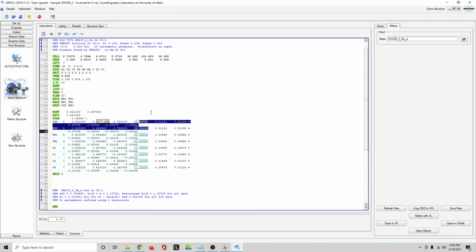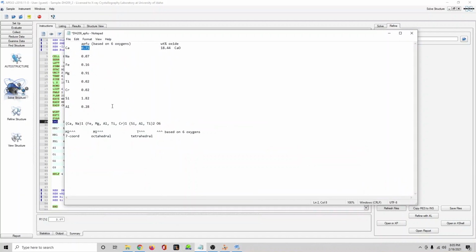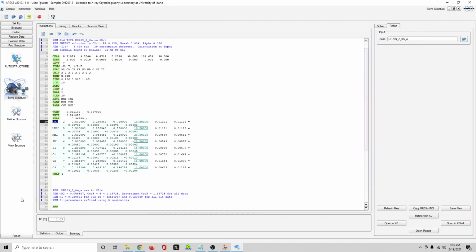being repeated by symmetry. So if you're going to actually assign a fraction to the calcium site, I think the strategy here, these situations get a little bit complex, but since all calcium is going in this site, and we're pretty sure of that because the size of calcium can only be accommodated by this site in this crystal structure, we can say 0.7 times 0.5 equals the new site occupancy factor.